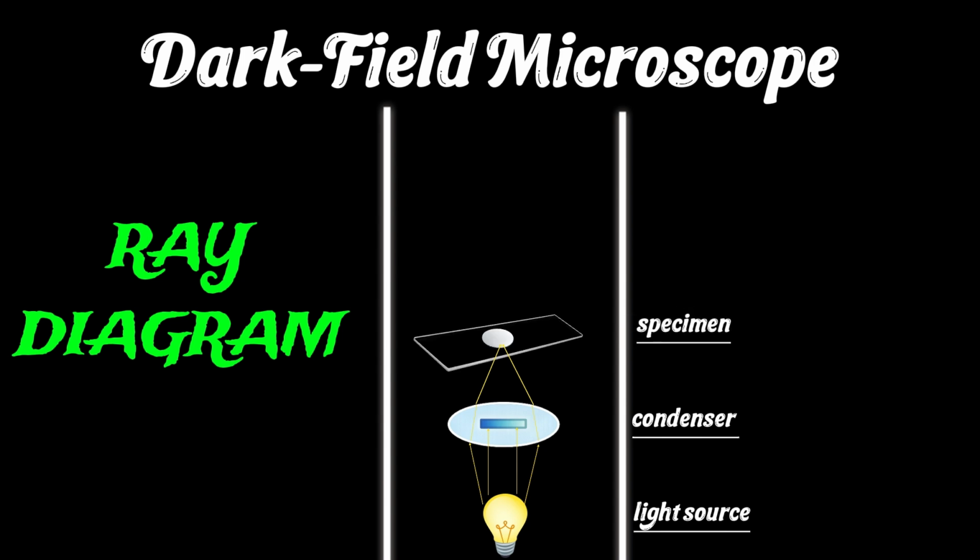Now imagine that no specimen is present on the slide. Since the light is traveling at a highly oblique angle, the rays bypass the objective lens without entering it. As a result, no light reaches the objective, no image is formed, and the entire field of view remains completely dark. Now place a specimen on the slide.